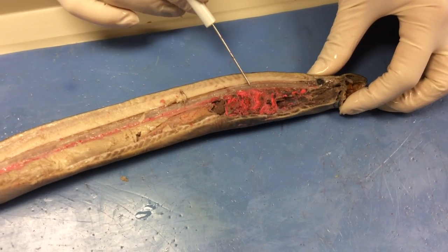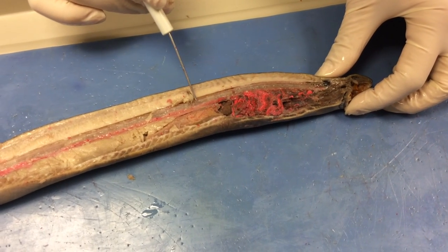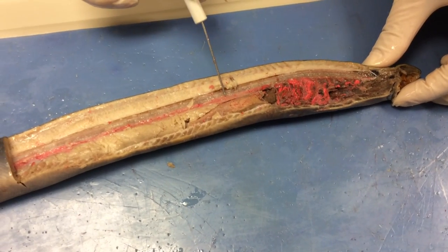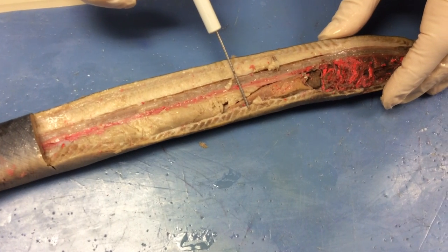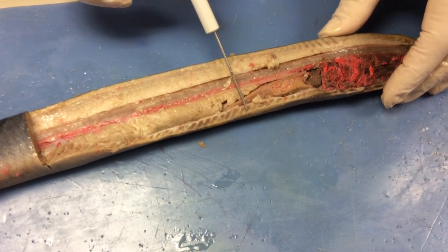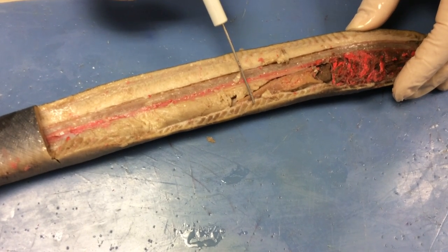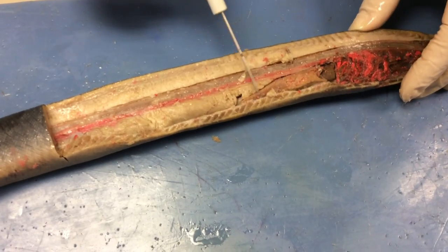Just ventral to the notochord that's running down here, you can see this red structure. And this actually makes up the dorsal aorta. What you can also see here are these two light and dark regions. This darker region is going to be the myotome, which is divided up by the myoseptum, where myo means muscle and septum essentially means division.